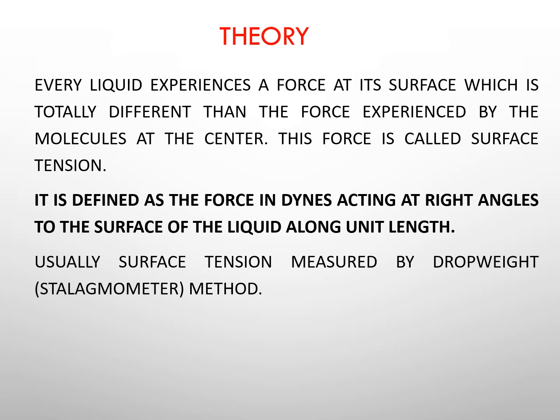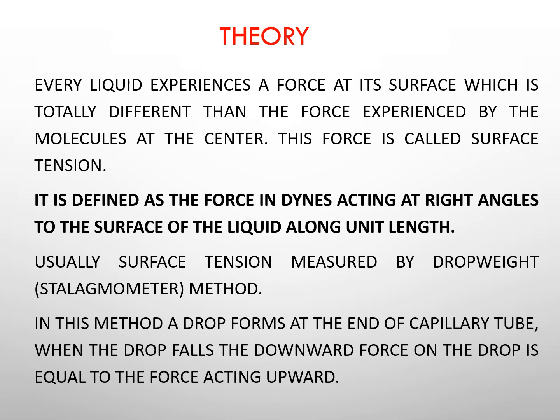Usually surface tension is measured by the drop weight method using a stalagmometer. In this method, a drop forms at the end of a capillary tube. When the drop falls, the downward force on the drop is equal to the force acting upward.